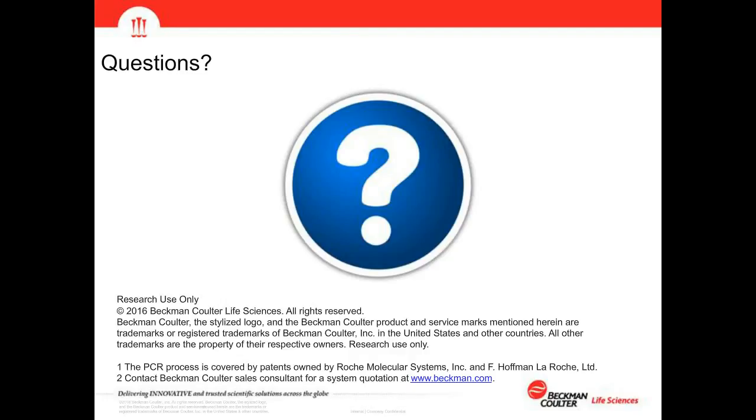Hello, everybody. This is David. So it depends on the protocol. Typically, we can give an estimate of about 2 days for a protocol that would take about a day to process manually, and then extending the length of implementation for protocols that are longer than that. So if you're looking at capture protocols, that might be a 2 or 3 day manual protocol.